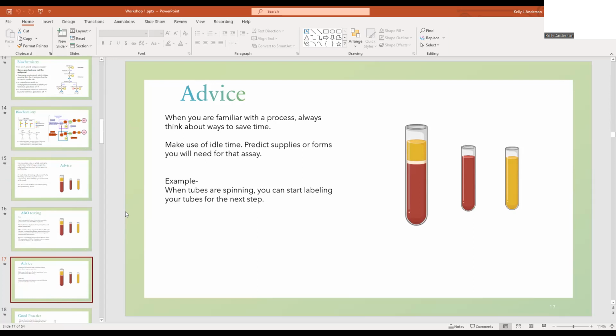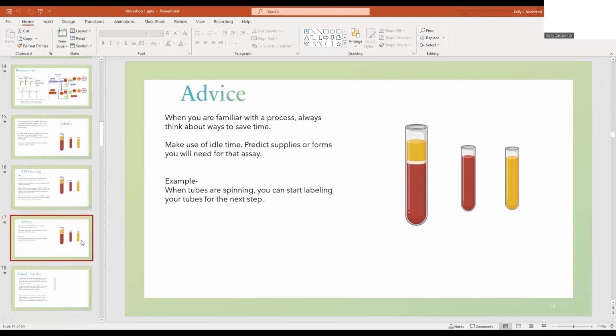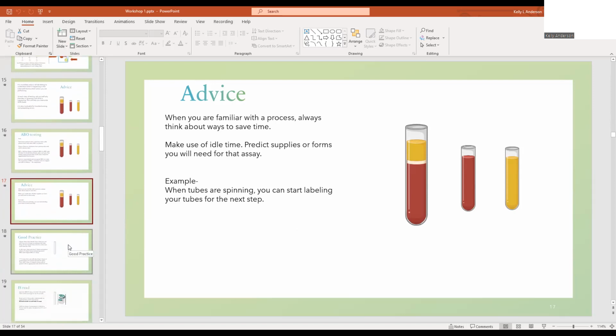As you get familiar with the process, keep in mind when you can do things in parallel. If you're spinning for a minute, you can be thinking about what the next step is, and you can start labeling all your tubes for the next step to save time.